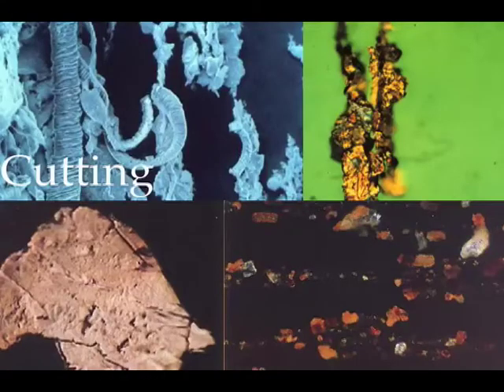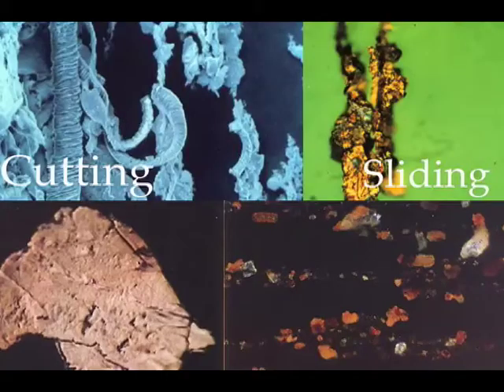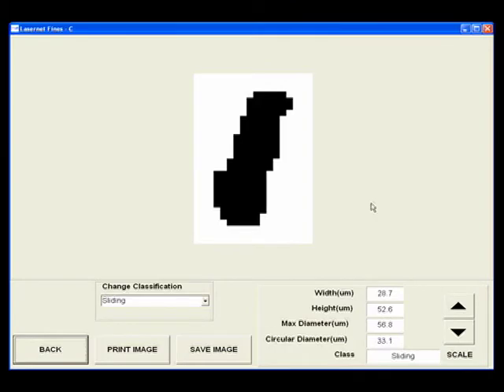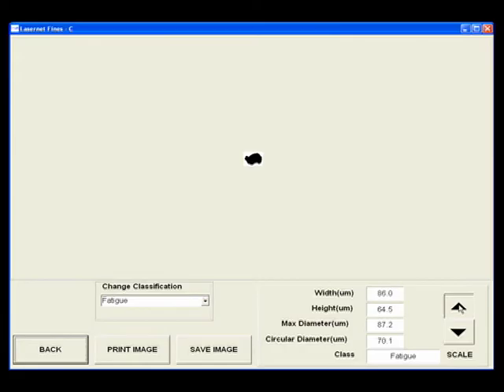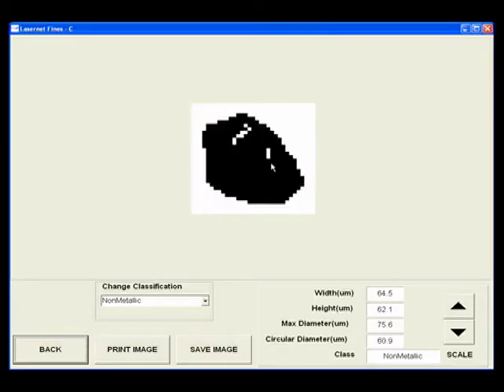Cutting particles, distinguished by their curly shape. Sliding wear particles, recognized by their elongated spiral shape. Fatigue wear particles, which tend to be platelet-like. And non-metallic particles, such as this grain of sand which is recognized by the translucent areas in the middle.